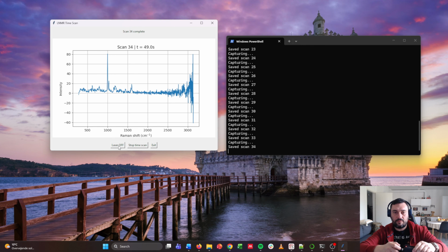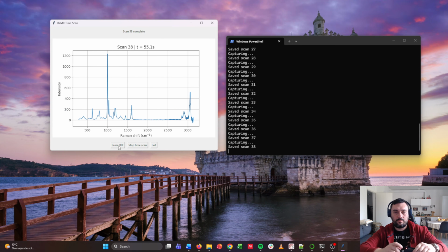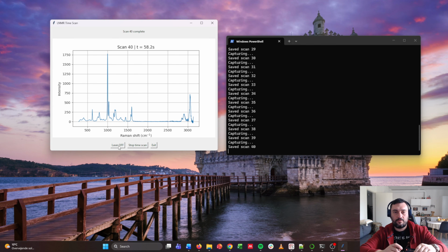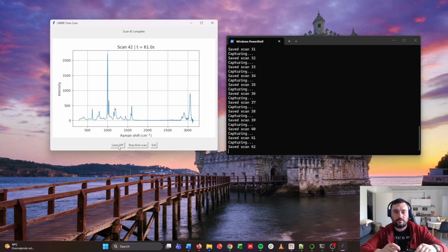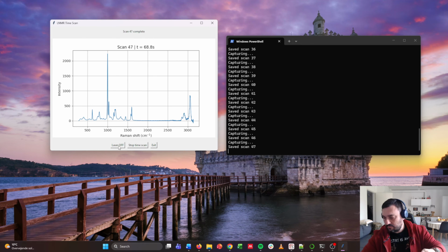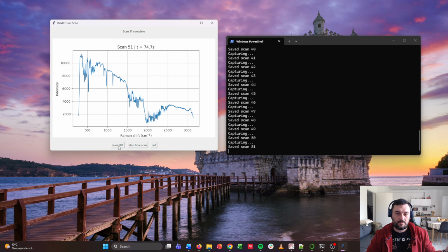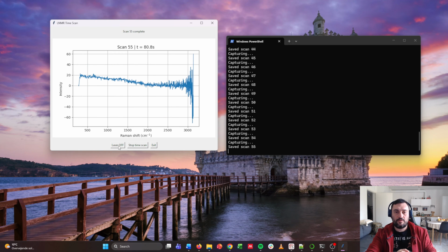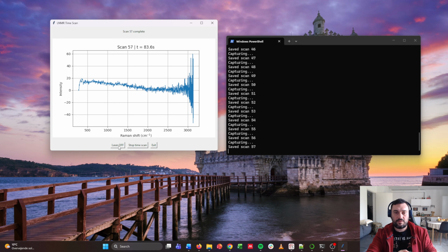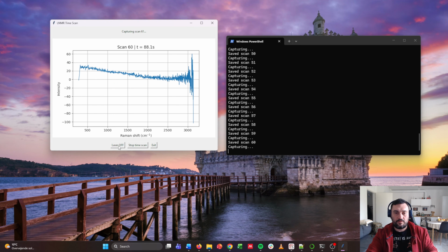Let's bring it back to the maximal signal. As you can see, if I don't touch it, the signal is quite stable. I have a couple of different samples. Now when I remove this reference sample and expose the probe to sunlight, you can clearly see a solid spectrum. Then I block it with my hand. There's still some scattering, and the profile looks like that.